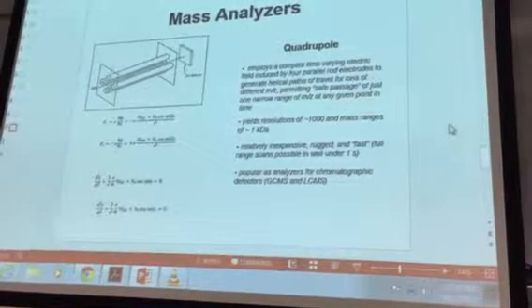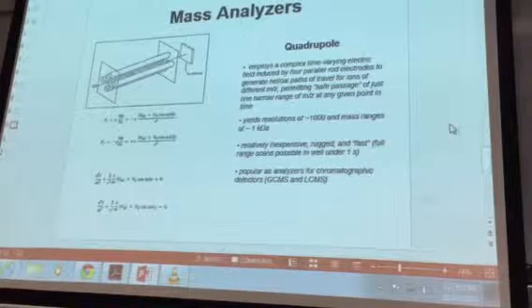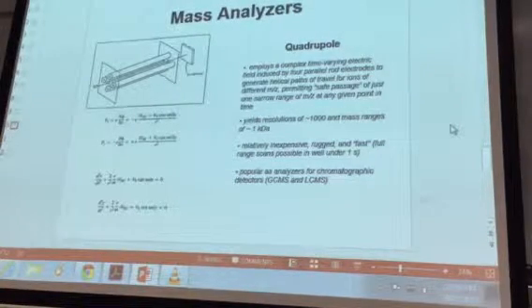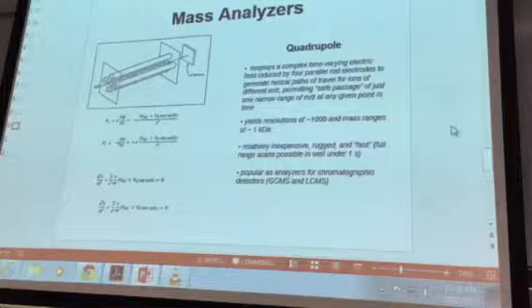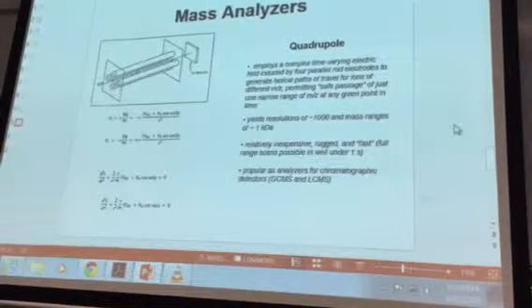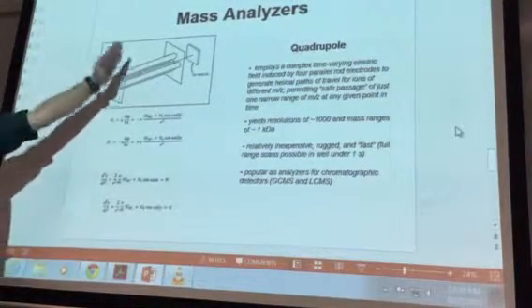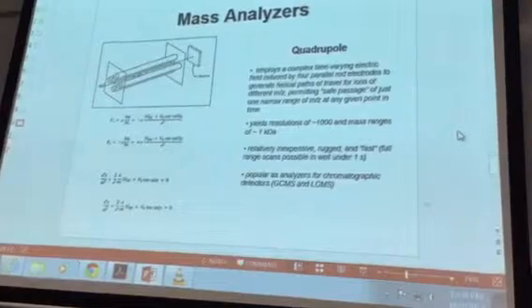A third one is a standalone, pretty nifty mass spectrometer that can accept ambient pressure gaseous samples. The other team will be working with that one. They're all similar in terms of the ion sources. They all have electron ionization sources. And mass analyzers, they all have quadrupole mass analyzers.